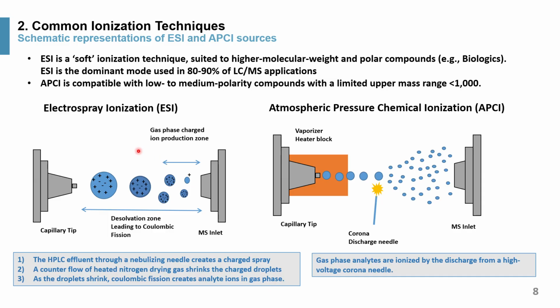We generally describe electrospray as a liquid phase ionization. In APCI, it's a gas phase ionization technique using a high voltage corona discharge needle to ionize the molecules.